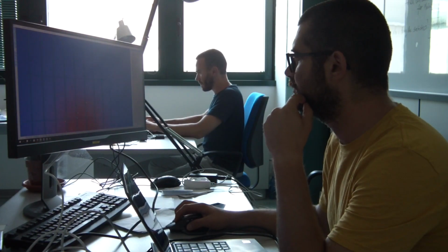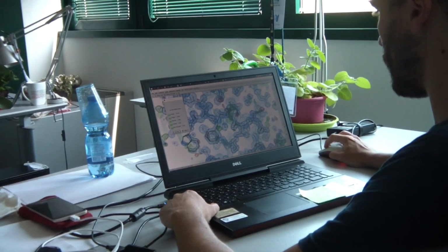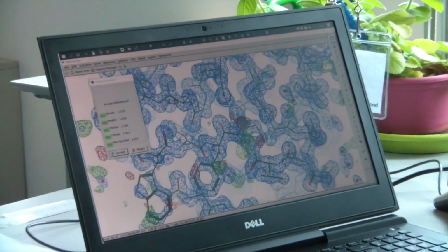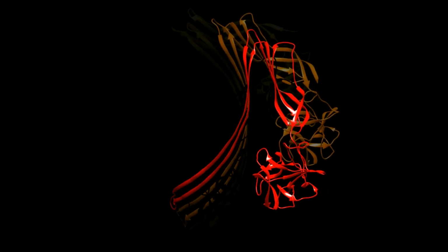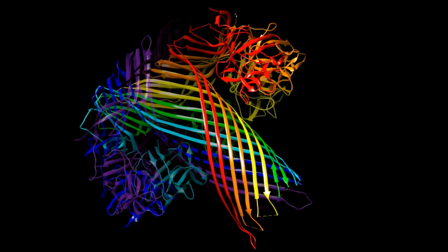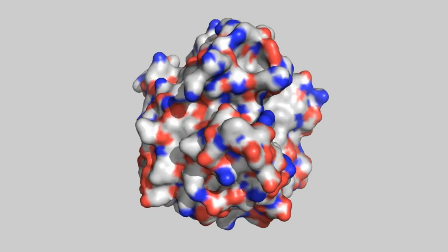The users coming here usually bring small crystals of biological samples like protein, DNA, RNA, and they are usually from the structural biology community. That is a very wide range of universities and other facilities around here, including pharma, who want a 3D structure of the protein to figure out why a certain protein is related to a disease or not, and try to design inhibitors that will fit in that structure, either to inhibit it or figure out why it's not working.